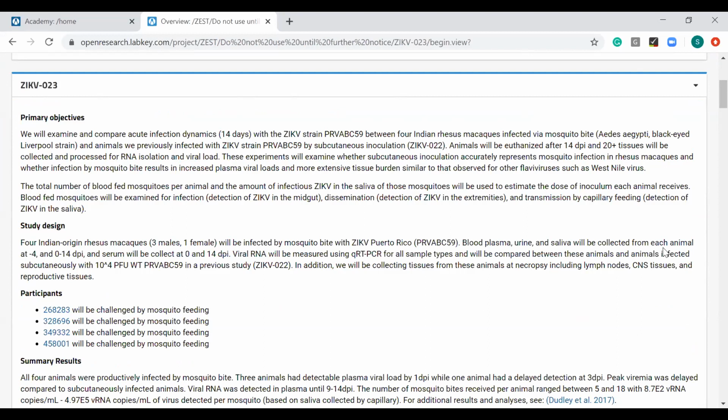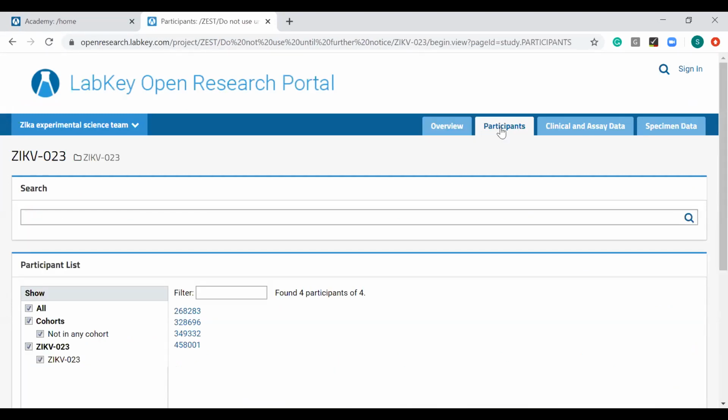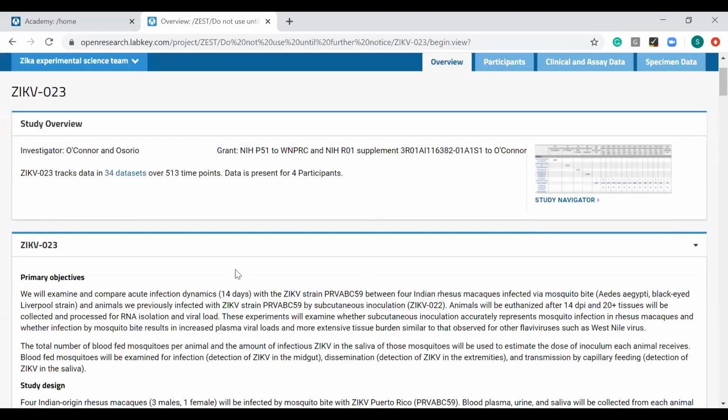And you work with LabKey by surfacing these panels and creating dashboards. These particular dashboards are just the default dashboards, but you have total control over these dashboards. You can customize them the way you want. You could get rid of these panels if you don't like them and bring in new ones, or customize the panels that you're offered. And that's what they've done here.